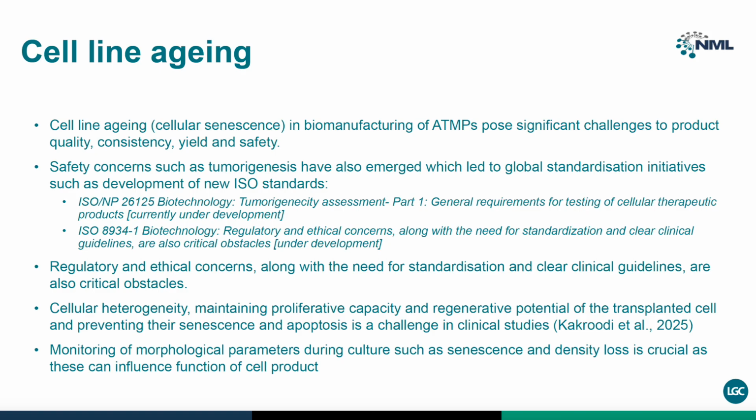So here, for example, the two new ISO standards currently in development include tumorigenicity assessment and also general consideration and requirements for cell viability analytical methods.